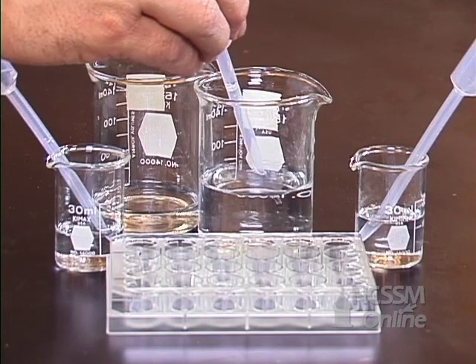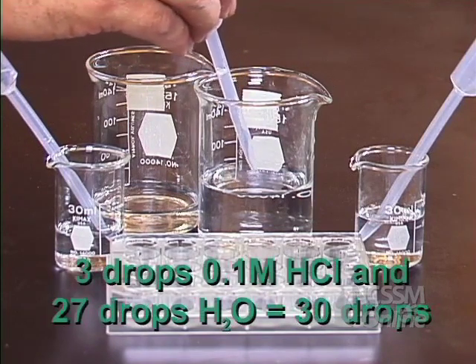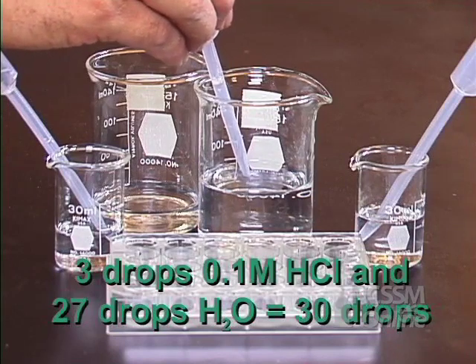You now have a total of 30 drops in your second well. This is a 1 to 10 dilution from the first well.